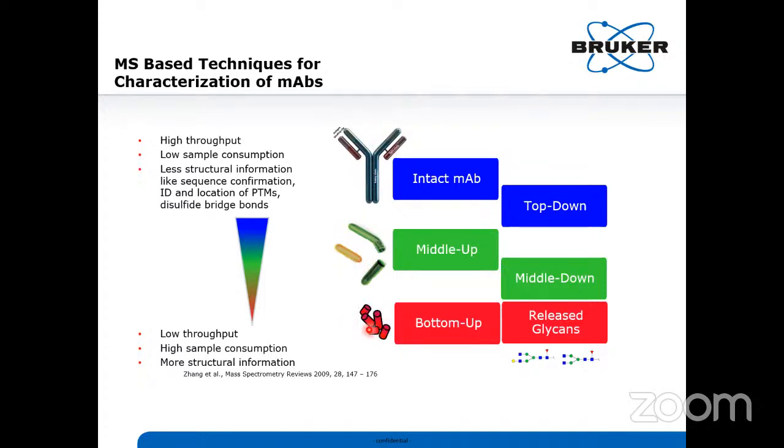Where you will get peptides directly. Why can't we confirm our protein at intact level? Why do we always go for protein digestion? Why do we have to wait 1.5 days, using enzyme, denaturation, alkylation, reduction? Why do we need this many steps to confirm one protein sequence? Why can't we confirm at intact level?